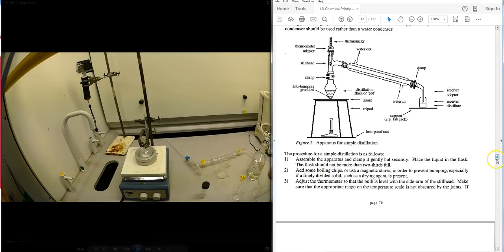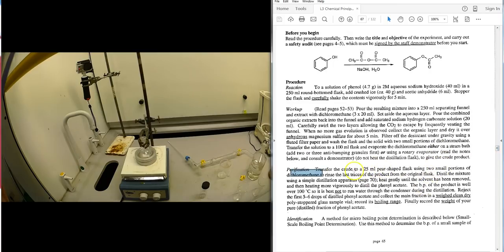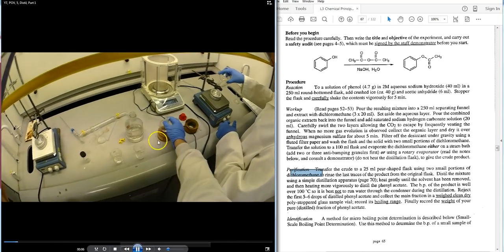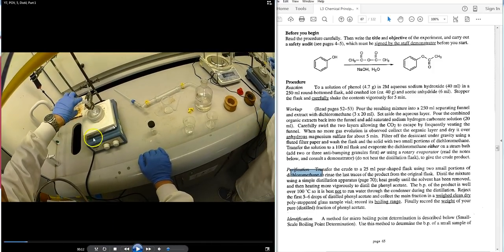Transfer the recovered material from the rotary evaporator into a 25 mL flask using two small portions of DCM. Use a pipette to transfer — do not pour directly — then rinse out any residual phenyl acetate from the inside of the flask with those two portions of DCM, transferring them over by pipette. Pouring directly risks losing material on the outside of the flask.